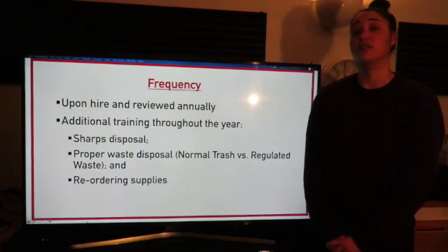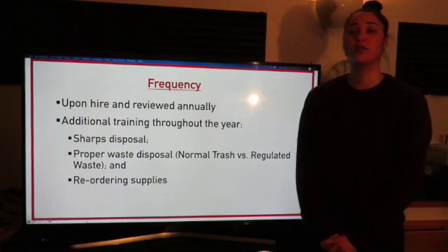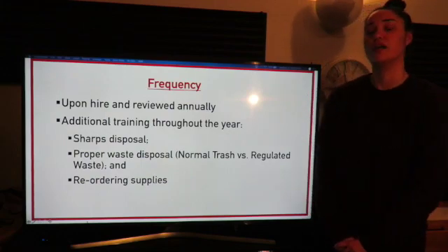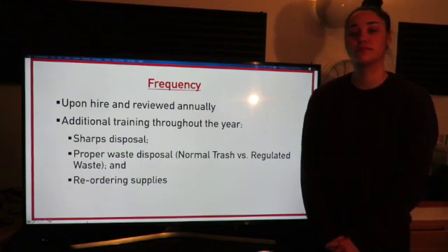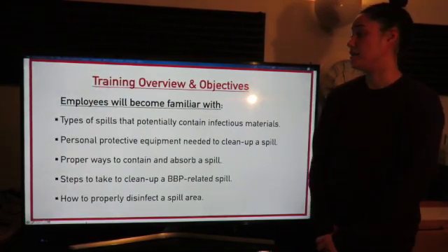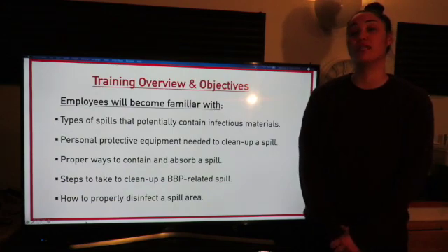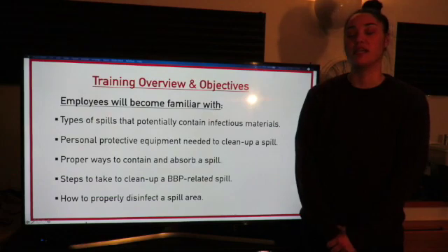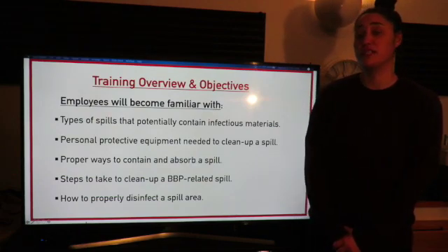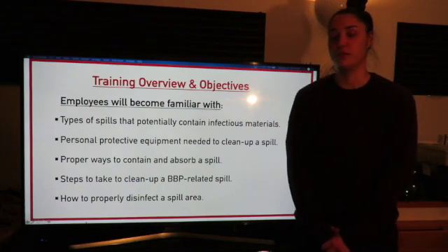They'll also receive additional training topics throughout the year, which will include how to dispose of sharps, proper waste disposal, and how to reorder supplies. After this training, employees will be familiar with the different types of spill that contain infectious materials, personal protective equipment needed to clean up a spill, proper ways to contain and absorb a spill, the steps needed to clean up a spill, and how to properly disinfect the spill area.